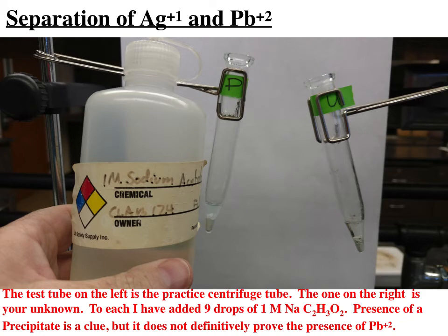So here's a picture of my two centrifuge tubes after I have added the sodium acetate into both. Again, on the left is my practice tube. On the right is my unknown, which I'm trying to determine which ions are present. So there is an indication of precipitate remaining, and that is giving me a clue as to what's going on for sure.